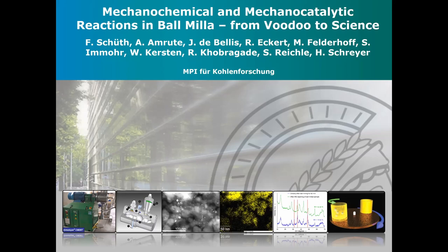So when I started with the mechanochemical reactions, which was maybe 10 years ago, I looked at it and said, this is all black magic. This is all strange things, nothing is reproducible, nobody really knows what's going on. I would say we still don't know what's going on, at least I still don't know what's really going on, but it's not black magic anymore. The results are totally reproducible. If you do it right, I'll show you reproduction towards the very end where you see how reproducible it is. But you just have to control many more parameters than you normally have to control in your conventional reactions.